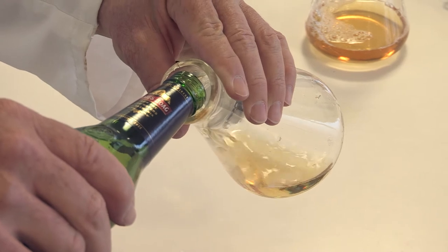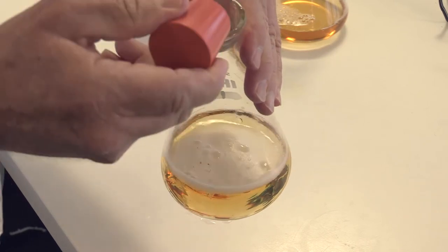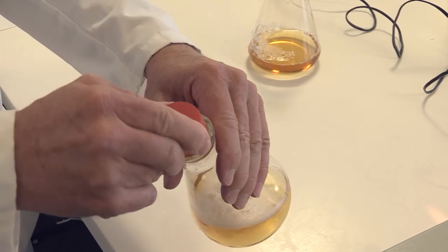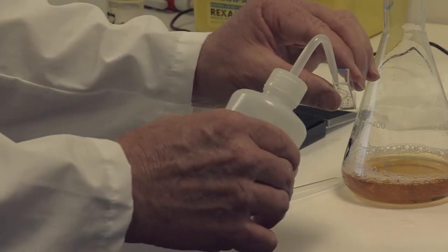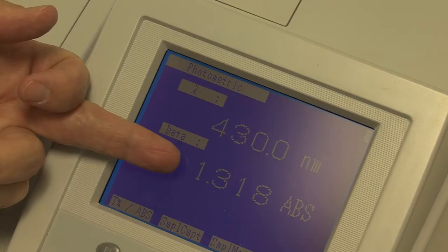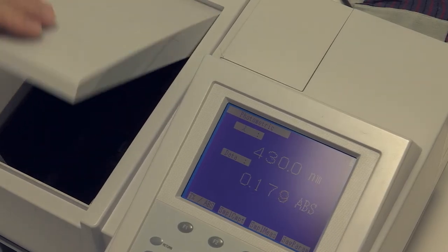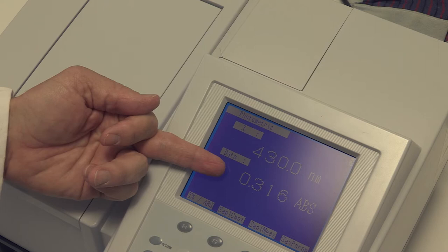The first part of measuring the colour is again the sample preparation as discussed previously. Once the sample is prepared it may need to be diluted so it can be measured. The maximum EBC units that a sample can have using a spectrophotometer is about 20. Firstly a sample of water is placed in the cuvette, the wavelength is set to 430 nanometres, and the spectrophotometer is zeroed. Then the beer sample is placed in the cuvette and its absorbance read and recorded. The absorbance should ideally be in the range from 0.1 to 0.8 for the most accurate results.